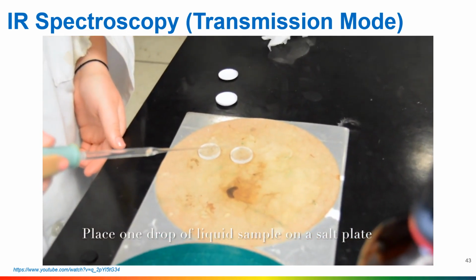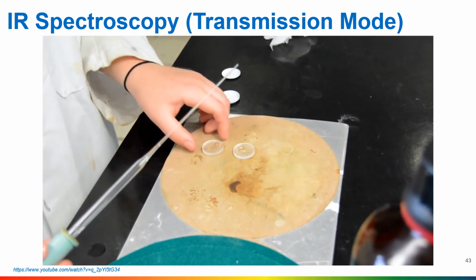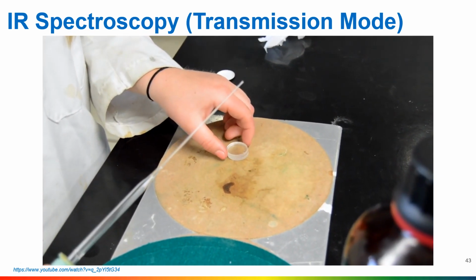Once cleaned and dried, place a drop of your sample on one of the salt plates. Place the other salt plate on top of the one containing the drop.